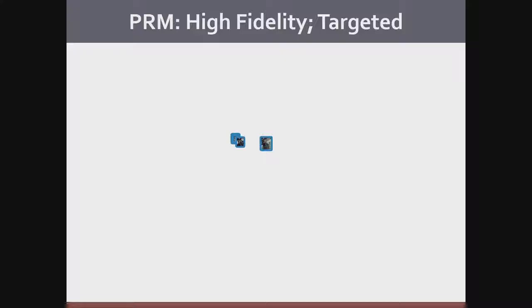And that's true, and I would call that the equivalent of doing things by parallel reaction monitoring. You can collect an image with a telephoto with incredible resolution and quality from a far distance away, but you don't then have the luxury of being able to go back and look at the greater image and consider other possible things that may be in that image or photograph. So this is basically the holy grail for data independent acquisition. It's this ability to collect a really high resolution molecular image that you can interrogate for specific analytes at the beginning maybe, but then over time potentially go back and reanalyze for different analytes.